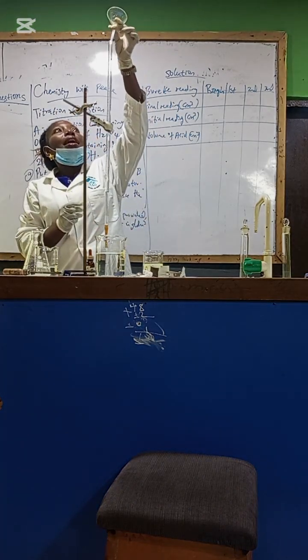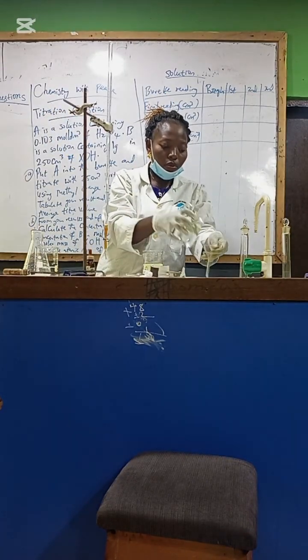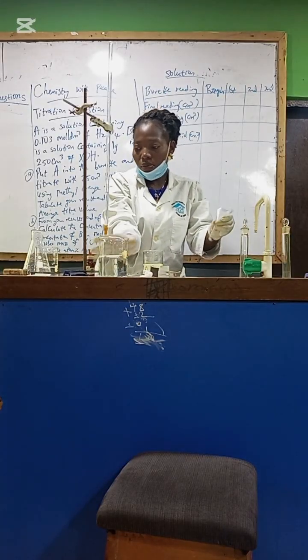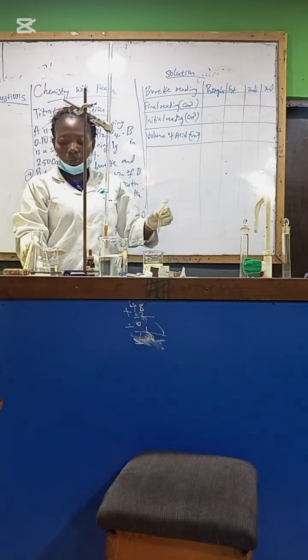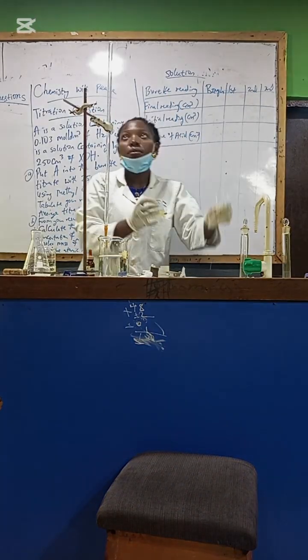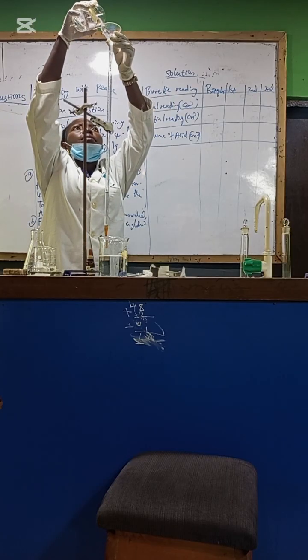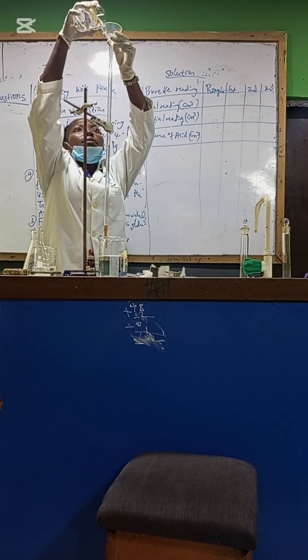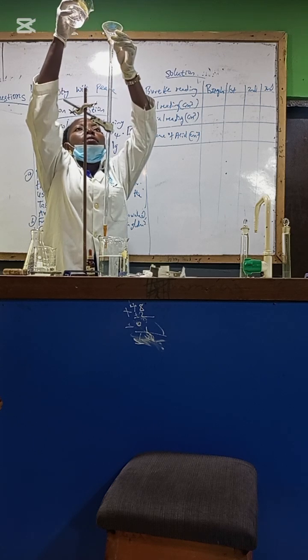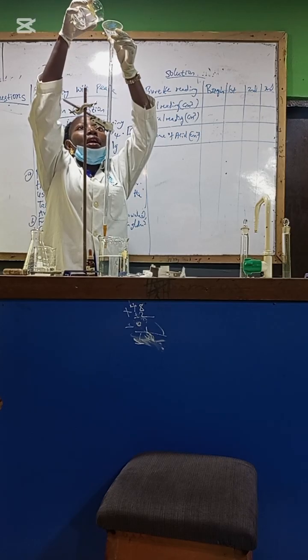we have to measure our acid. Remember to take precaution, avoid air bubble.